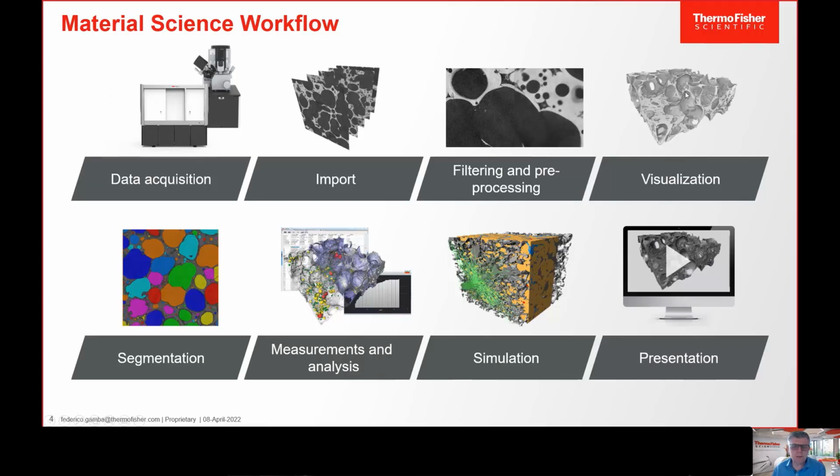Then the first thing you do, usually, is a 2D or 3D investigation of your data. So I call it visualization. It's more like a doctor looking at the images and trying to understand quickly what it's all about. And then up to here, yeah, you have nice pictures, nice images. You could do even a video, but then you want to measure. You are a scientist, you want to get some meaning out of pixels.